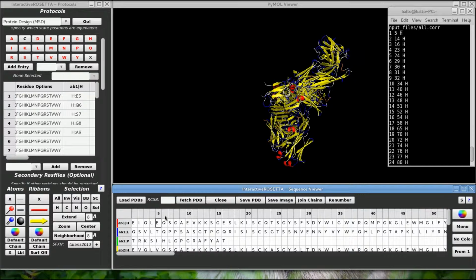Before we do it, we have to check the actual PDB numbers on the residues in the sequences. The numbers in our reference are PDB numbers. These labels on the sequence viewer are simply counting the absolute residue position. In these sequences, there are no missing residues and the numbering starts from 1, so it is not a problem. If it were a problem, I could click this button over here to change the grid numbering to PDB numbering. Anyway, I'll spend some time selecting everything I want.